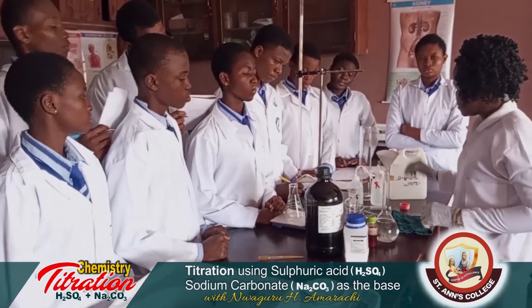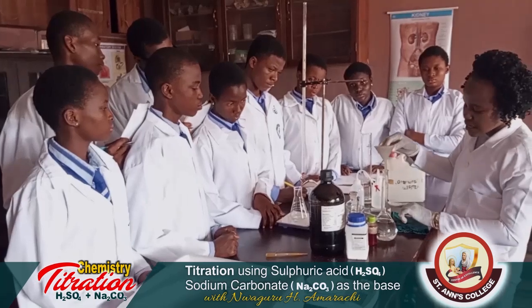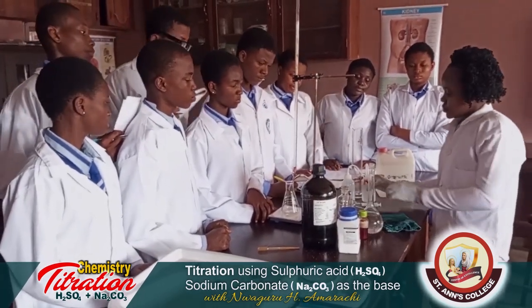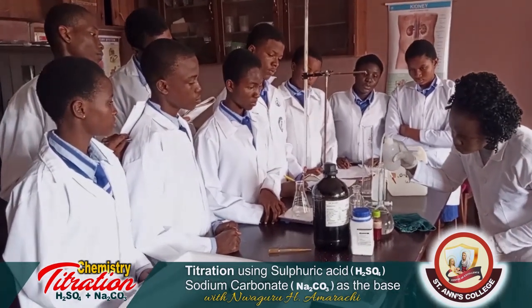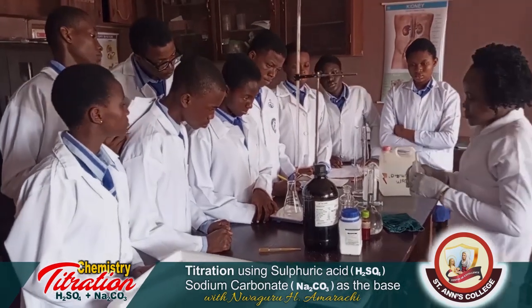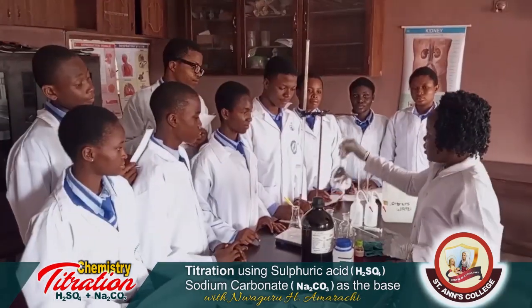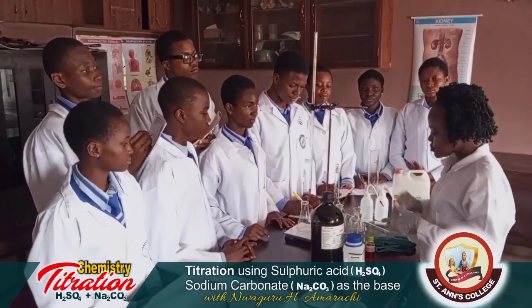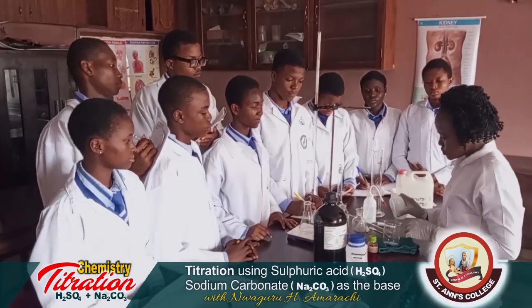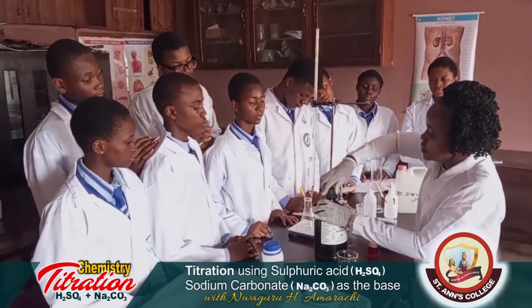Now at this point, you have to make use of your wash bottle so you can get the exact measurement of this 500 ml. Now our base is ready. Then let's prepare the acid. Remember, this is sulphuric acid.